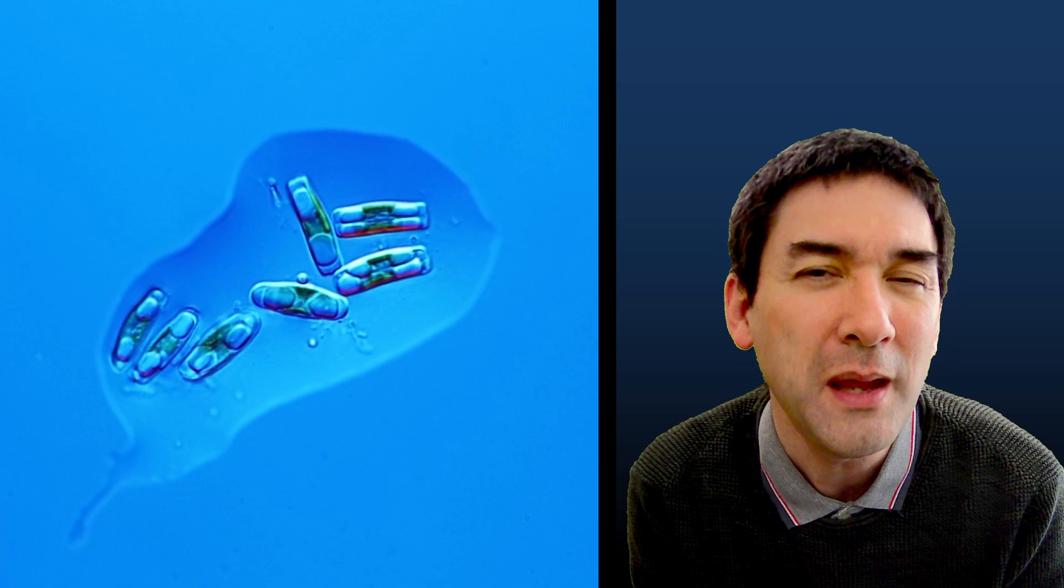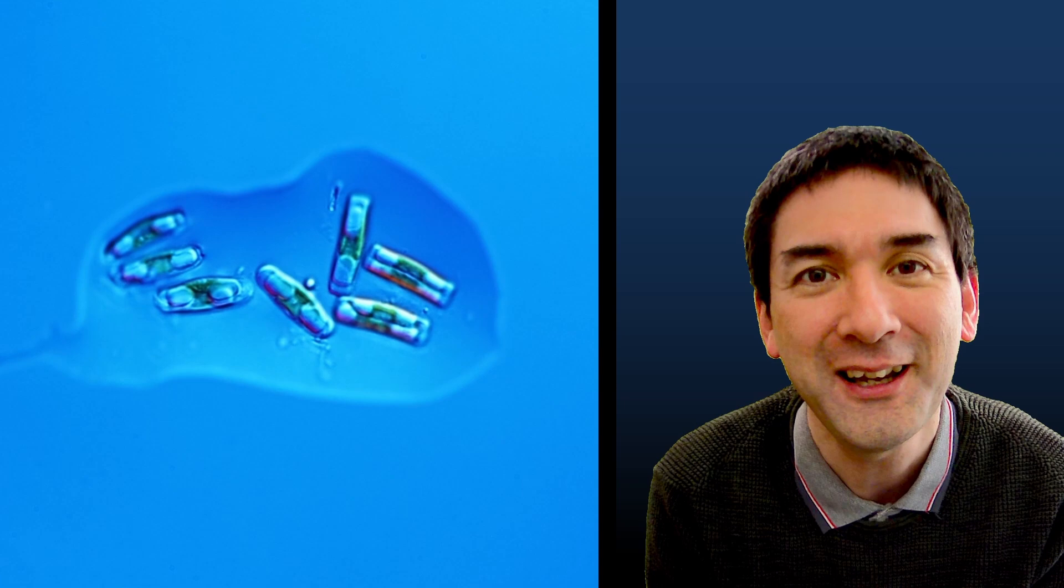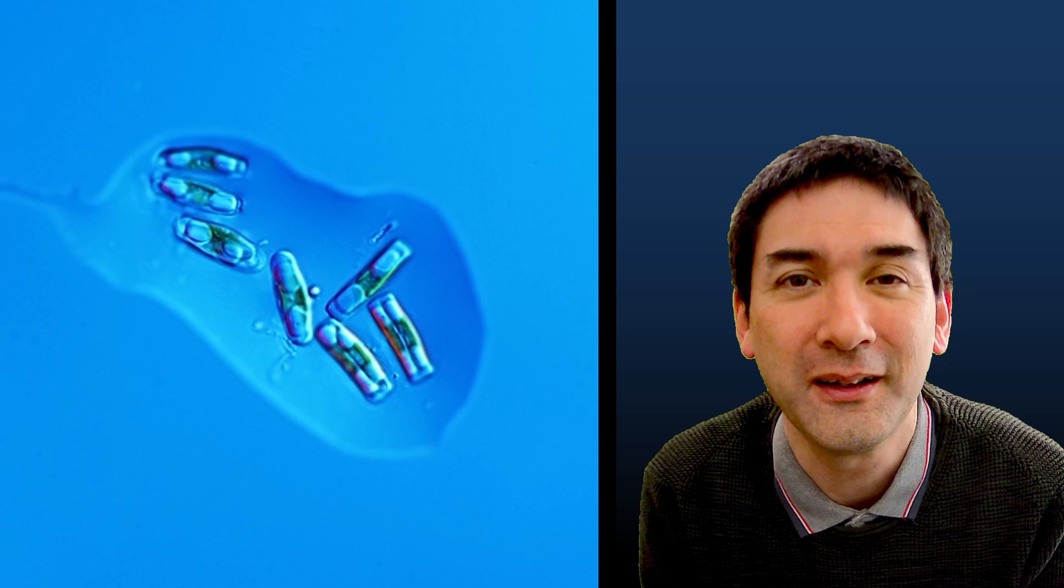Here, a little bit of a nice video effect here, where I'm rotating those little algae around in each small drop of water. They look quite beautiful.